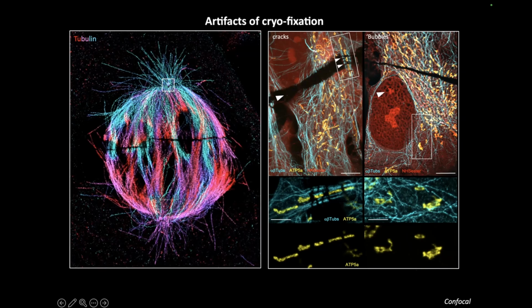This really is a sign that the temperature of the cryofixation was not properly controlled, or that sometimes it can happen that the sample was not perfectly immersed into the ethane. And this is really catastrophic for the cell. So if you have this type of bubbles, you just have to discount this sample and work on the fixation condition. Okay, that was just a little parenthesis because I realized I was presenting this technique a lot without mentioning any of the things that you don't want to see.